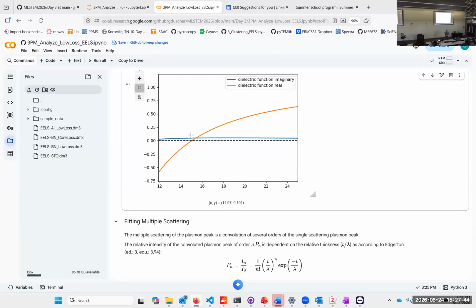Oh, excellent. So that's what I do with the valence electrons of the sample. I ring it. This one rings probably a few thousand times.